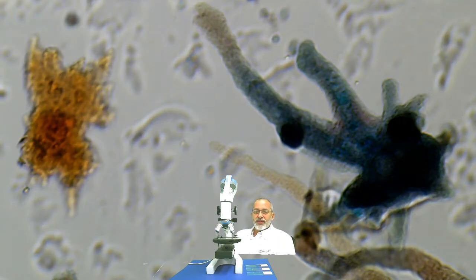This is a prepared slide, so all of the critters we're looking at are no longer actually alive. Their lives have been donated to science, and that's why they're not actually moving around the screen. But you have to remember that these are three-dimensional.